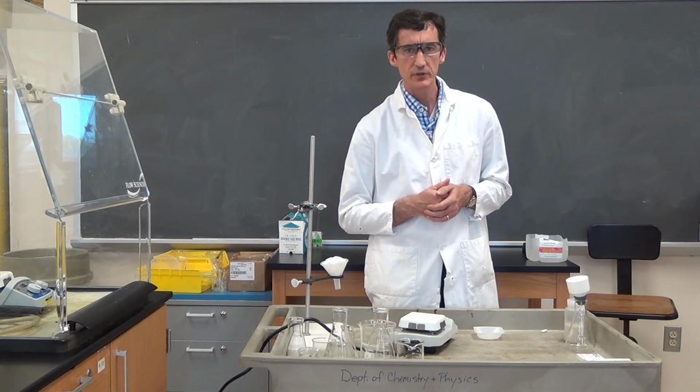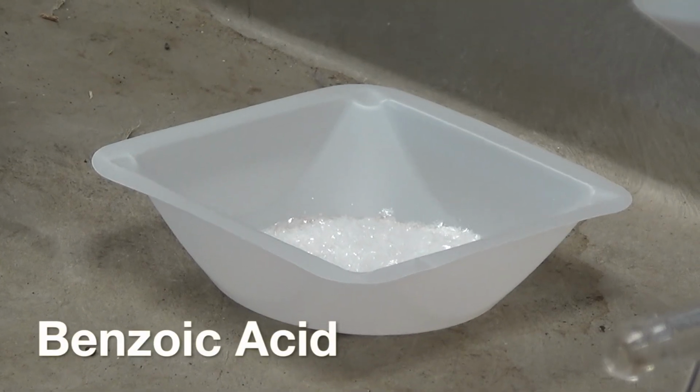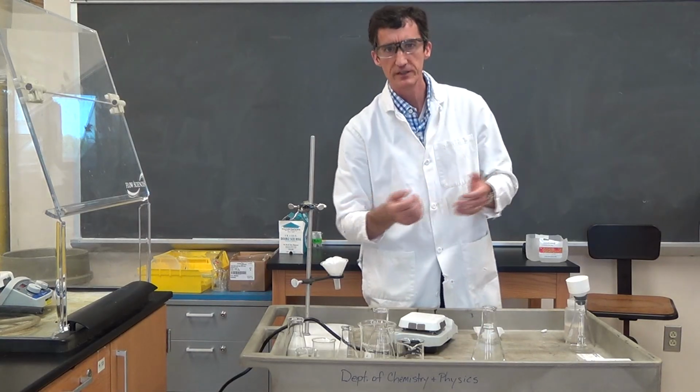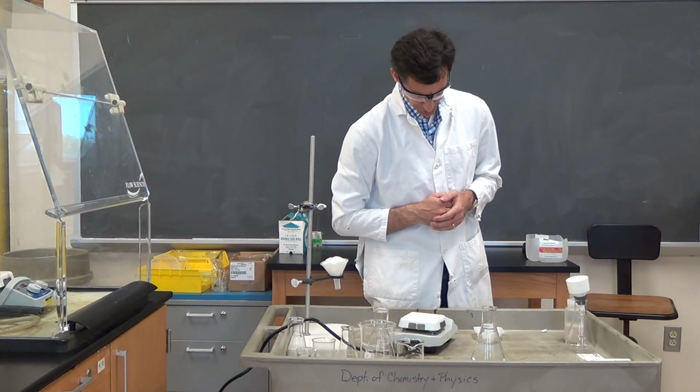Today I'll be demonstrating recrystallization. We'll be recrystallizing benzoic acid, and for the purpose of this demonstration I'm going to use water since it's not flammable or toxic and I'm not inside a hood enclosure. Benzoic acid does recrystallize nicely from water.